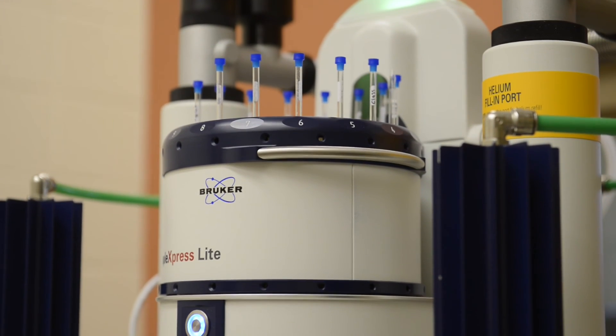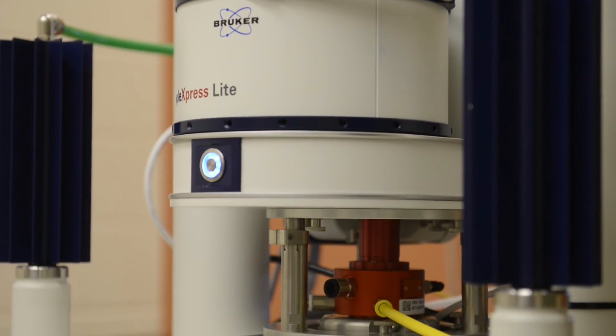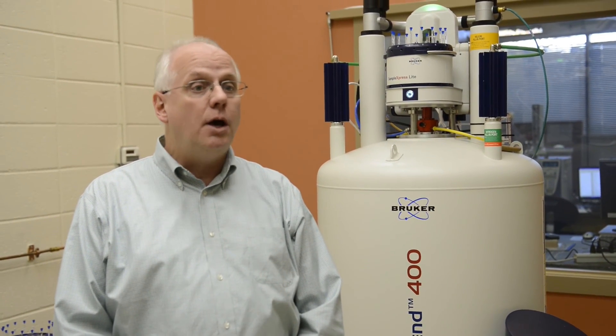This is a 400 megahertz nuclear magnetic resonance spectrometer. It is one of the most important pieces of equipment that a chemist can use to probe matter. This particular instrument gives us information about molecular structure of compounds that contain carbon.